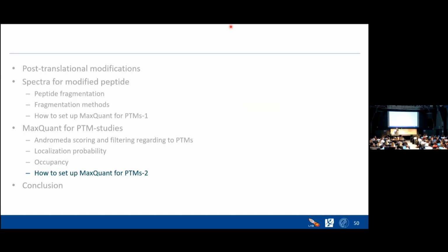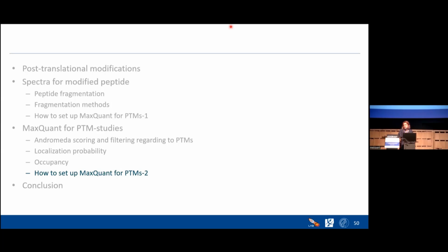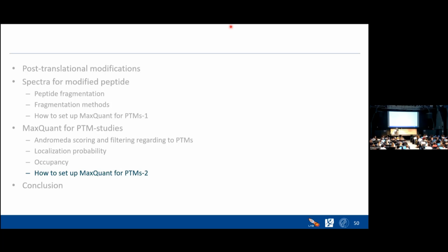Okay. But I think at the moment, many people are already using HCD instead of CID. If you are using HCD, it's fine. Yeah, because followed by the ETD, we can set a low energy for the HCD, which I think would be better for keeping the phosphorylation, because they have a very labile bond attached to them. Yes. Okay, thank you.